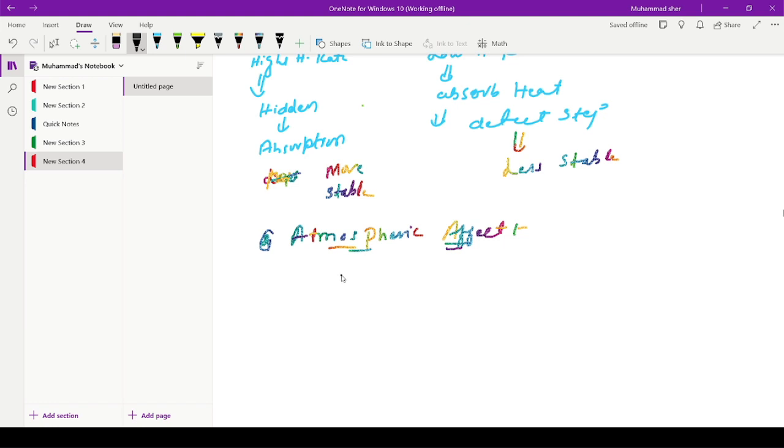If we have a compound that is unstable to oxidation, then in this case we would not be able to detect the changes that occur with the temperature.